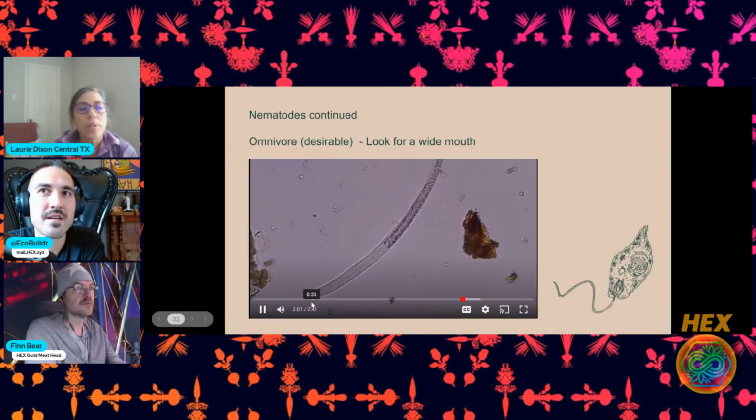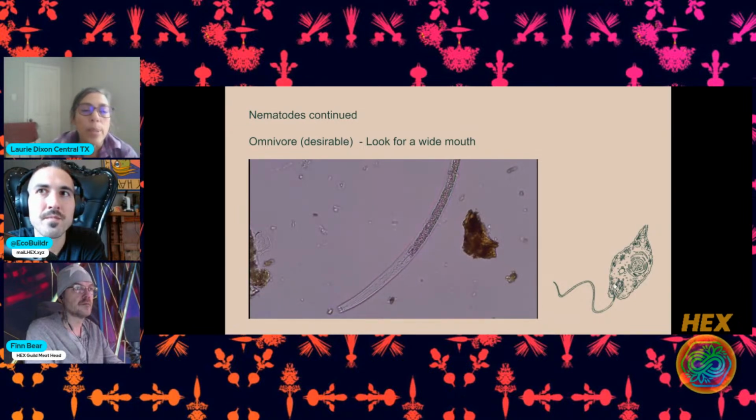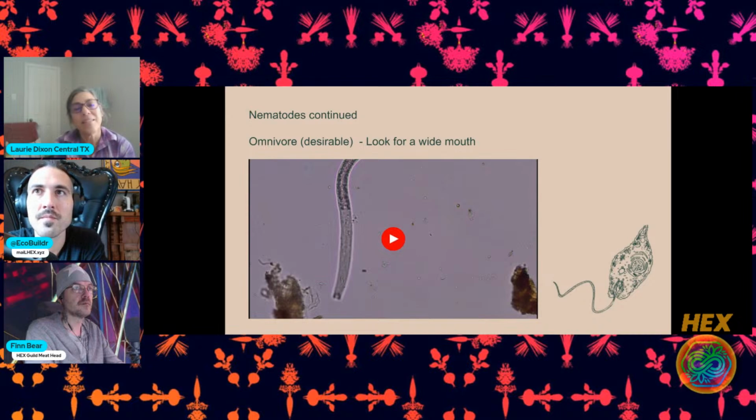And so in this video, you can just kind of see that really big mouth part down at the bottom. They have a very wide mouth, and it's just very practical. They have a big mouth so they can stick big things in there.